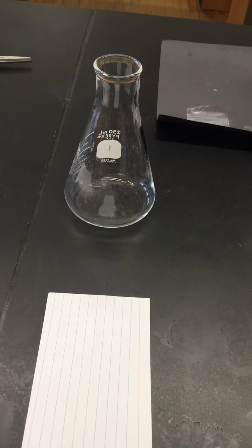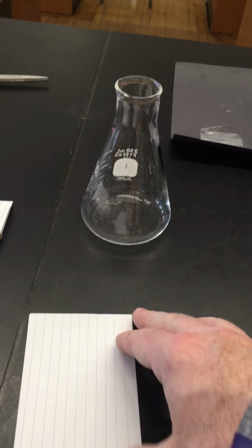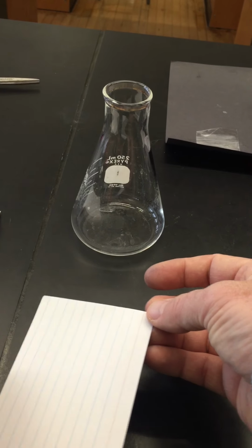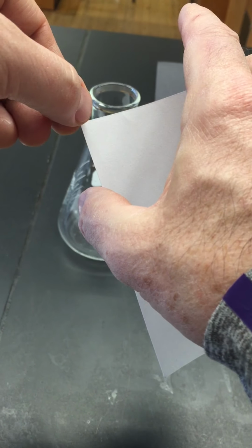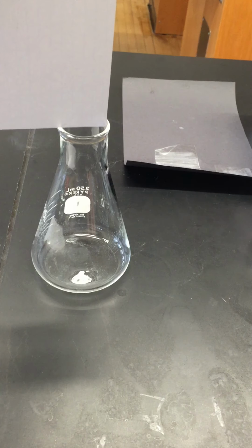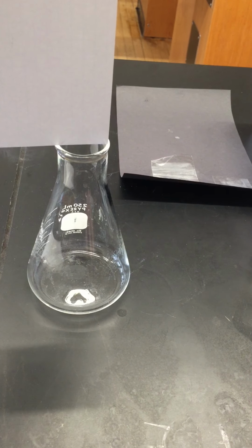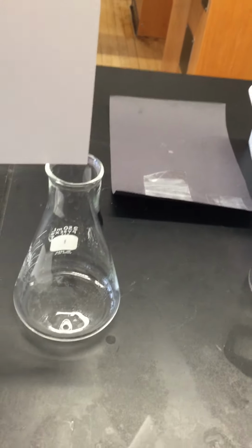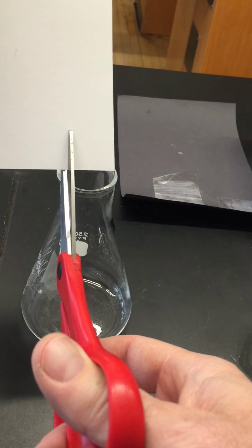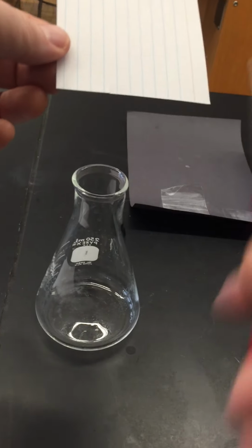Okay, this is the Iodine Fingerprint Lab. Essentially what I'm going to do is take a 3x5 card. I'm going to hold it on the edges, and I'm going to cut it to width here. It can't be any wider than the mouth of the Erlenmeyer flask, but I don't want it too thin either, too narrow. So I'm going to measure this kind of by eye. I use the lines to make it a little bit easier.